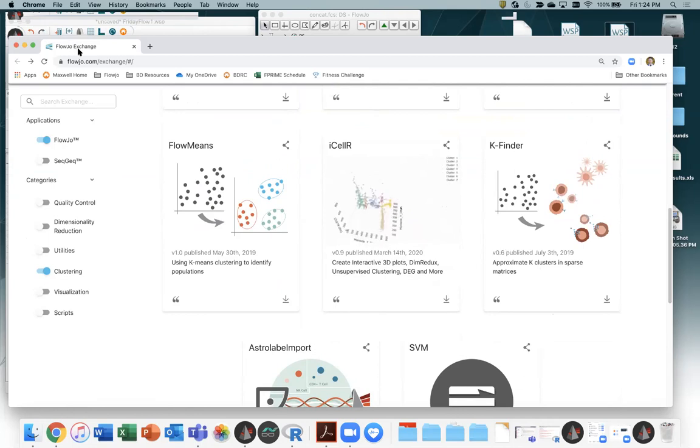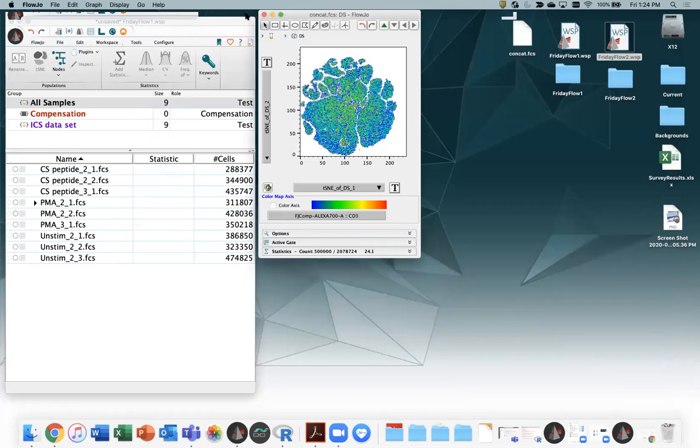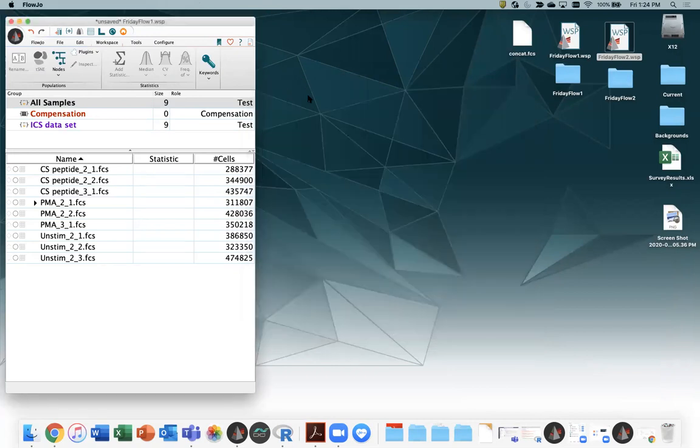So moving into FlowJo. There's a result we'll talk about in a little bit. Okay, so I just have this one workspace up here, and I've added a handful of files that have different stimulation conditions. And the very first thing that I wanted to show, I talked about it but I didn't show a lot, was the difference between doing some kind of cleanup gating or not. So I just took one of these samples. So we've got different stim conditions.